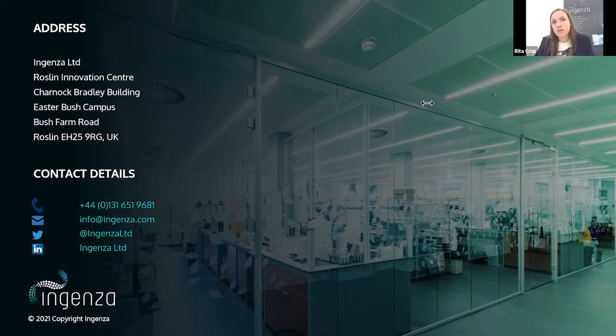We had a lot of discussions about that because people were particularly concerned. Well, if I go away and do a quick measurement, for instance, I'll give an example that is common to us. If I do an OD measurement in a spectrophotometer, you take just a number. How do I make sure there's a piece of hardware next to that equipment and that equipment and that equipment, so I can always input? And then people were concerned that they would have to log in with their username each time they want to input some data in different parts of the lab. I think we worried a lot more about it than it actually ended up being a worry.